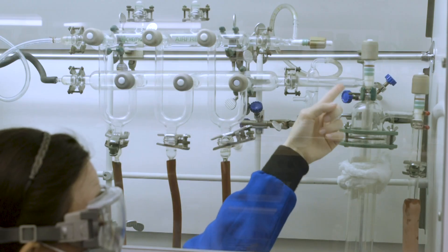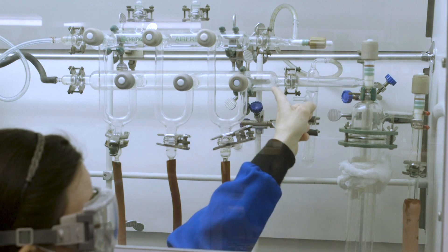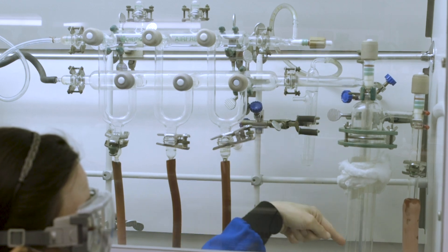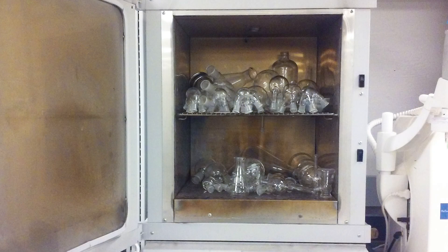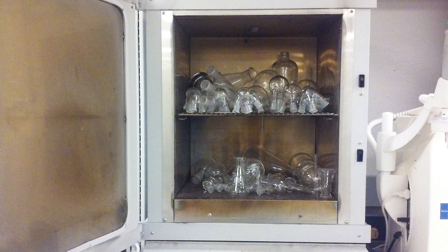Valves that switch back and forth between the vacuum and inert gas functions must be labeled and well understood before beginning. Glassware should be prepared overnight in a drying oven at 125 degrees Celsius or 140 degrees Celsius for four hours and assembled while hot to prevent atmospheric moisture deposition. Always inspect glassware for any cracks or defects and dispose of any defective glassware.